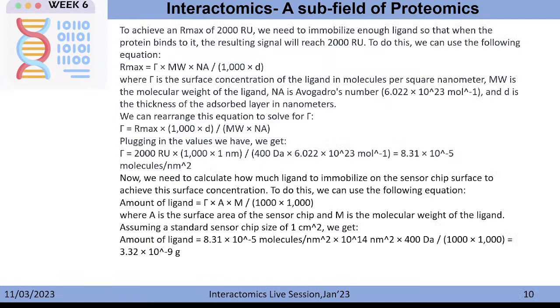So hopefully you have understood it. The main thing I would like to stress is this formula of Rmax, where you need to find out how much ligand you need to immobilize on the chip so that you can get a particular response.